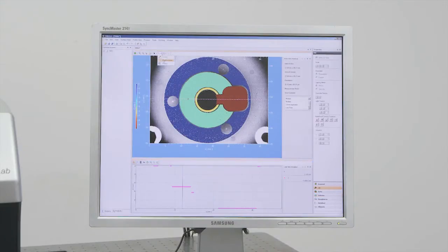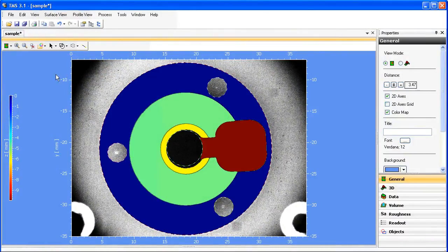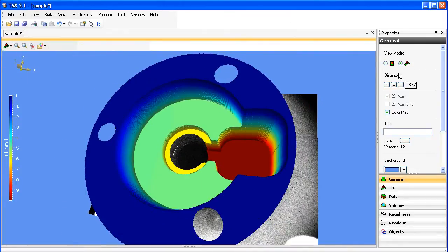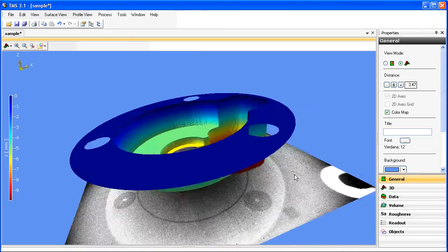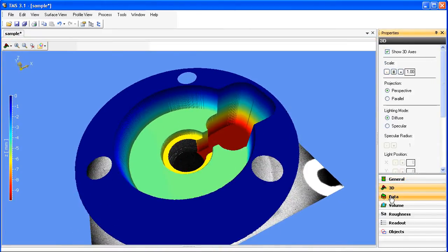The topography software provides outstanding 2D and 3D data representation of structure heights and shape on both rough and specular surfaces with sub-nanometer resolution.